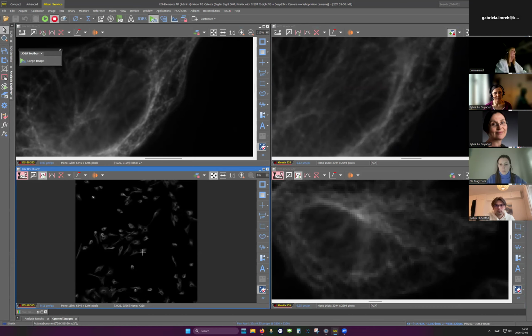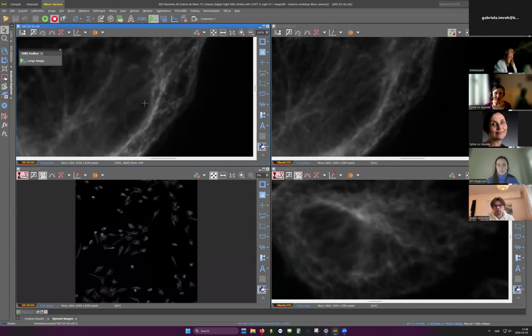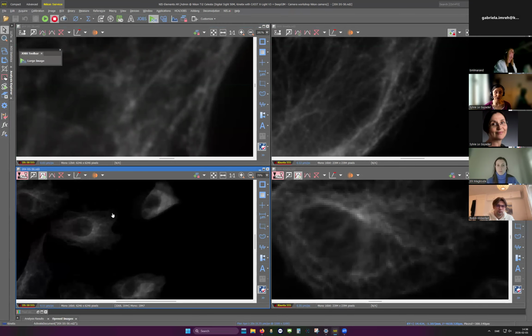And the pixel size of the DS50 is 3.76. Calculating according to this formula, we should have 3.4 micrometer pixels to match with the 20x. So basically at the top right, we're imaging almost at Nyquist sampling. With the top left, we're oversampling. And this is with the 60x objective. And when we change objective and go to a lower magnification, it would require smaller pixels on the camera.